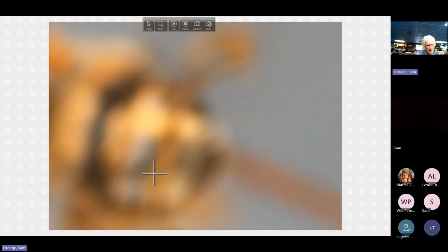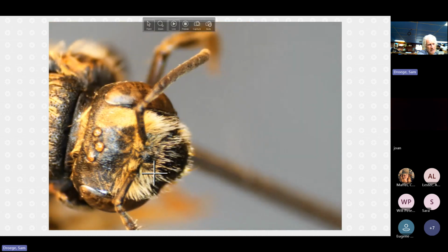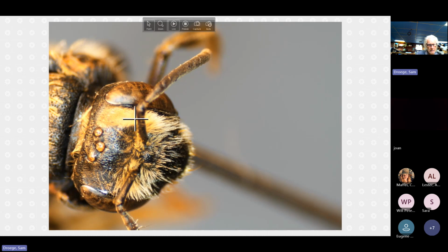Trachandrenas are pretty fun, in terms of there being a whole series of characters, even if they're sort of blendy. And after some experience, it's like, okay, I could see that. In this case, the angle is a little bit odd. This fovea is not showing up as brightly as this, but you can see that this distance and this distance are relatively close compared to some of those others. So we're going to check that box.